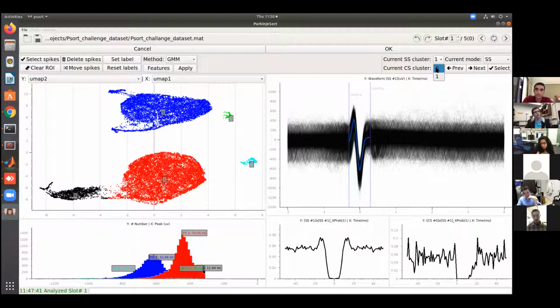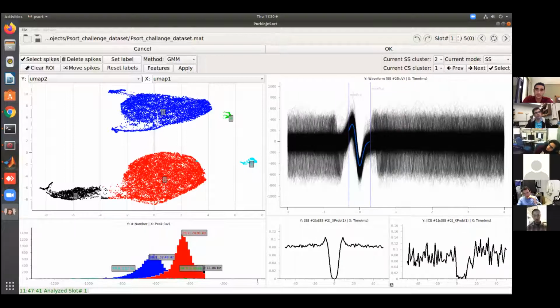What about the other label of complex spike? So this one definitely does not suppress that, but what about label 2? When we look at label 2, it is suppressing the other complex spikes. So this is confirming that one cluster of complex spike is suppressing one cluster of simple spike, and another cluster is suppressing this one. What about the other ones?